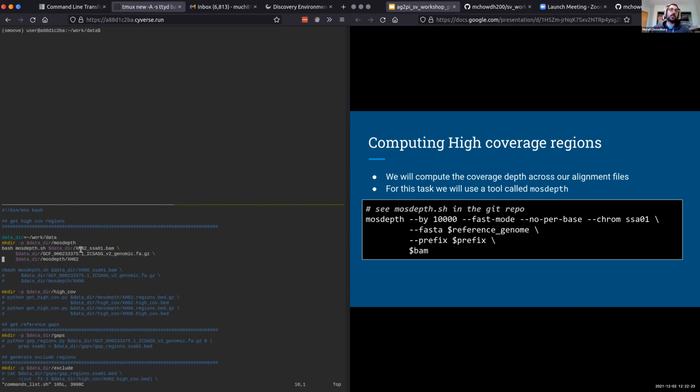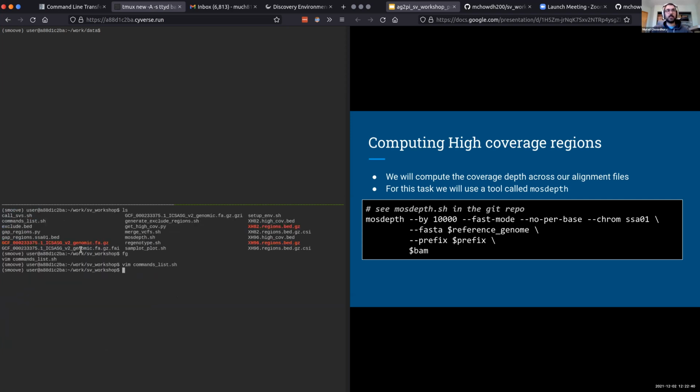All right, so by doing that, we'll keep everything uncommented. Then in order to save this file, we hit the colon key, W to save our file, and then colon Q to exit. I may have been going a little fast there. Does everyone understand that? If anyone is able to respond. If not, then we will go through and run that.